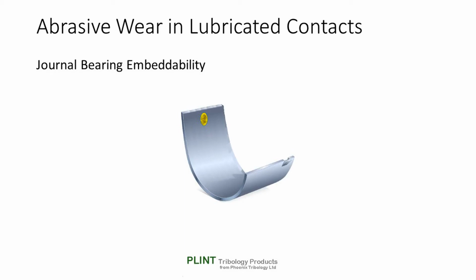It will be noted that the load, either static or dynamic, is not considered of importance, except inasmuch as it may provide a mechanism for setting the bearing gap. For tests on actual journal bearing components, the key challenge is the injection of particles in a controlled fashion into the test bearing. As with any tests involving abrasive particles, there are uncertainties associated with how long the particles remain in the contact and how long they avoid comminution.